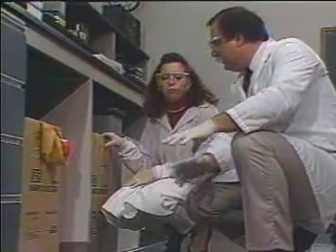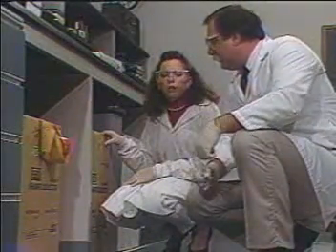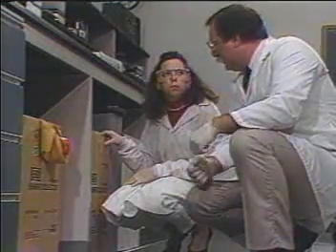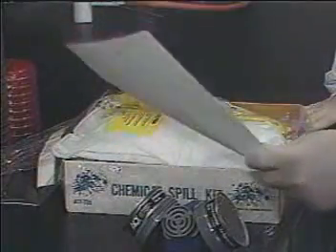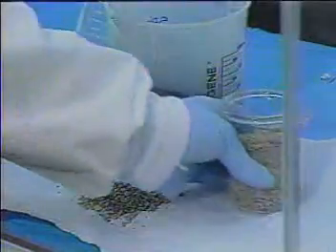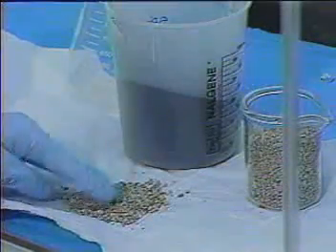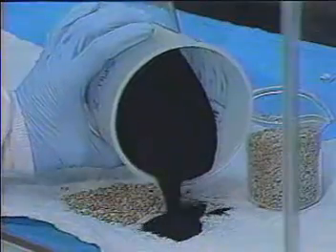Create contingency plans for spill situations. Remember that flammable liquids spread quickly, and the larger the spill area, the greater the chance of fire. All ignition sources must be turned off. Keep cleanup equipment and materials nearby. Personal protective equipment is also important. See your supervisor about respirator training. Remember, vermiculite absorbents, such as kitty litter, do not keep vapors from rising dangerously in the air. Ask your supervisor about activated carbon absorbents, which may.